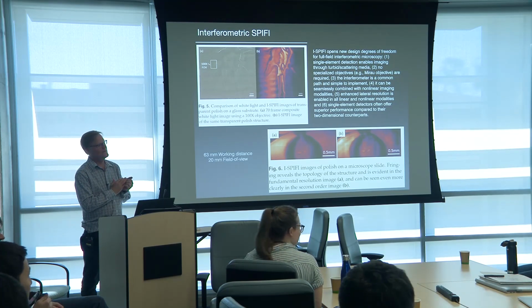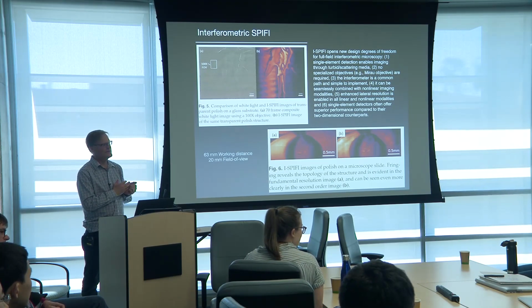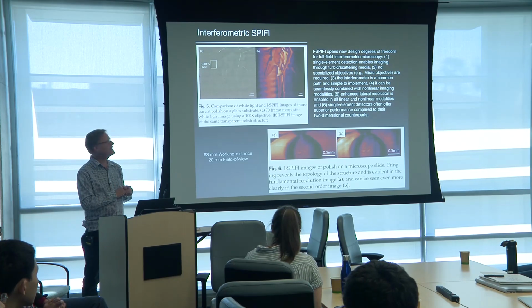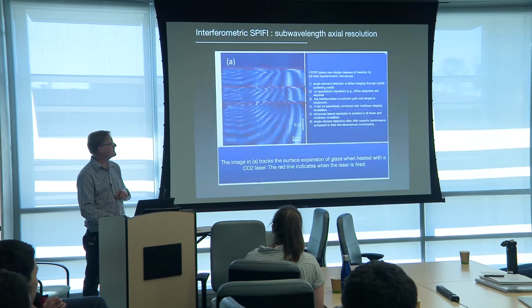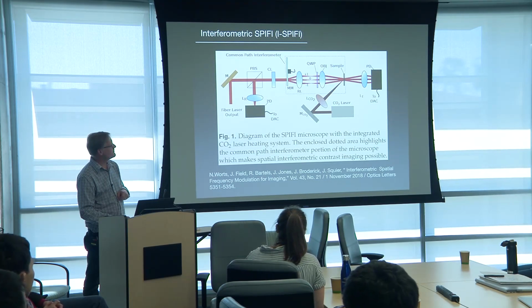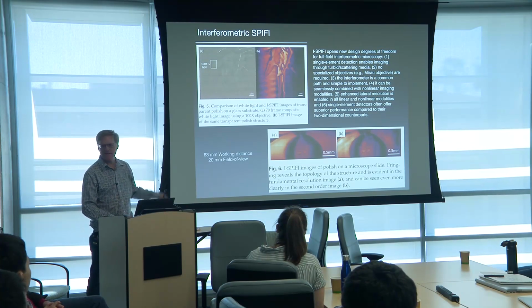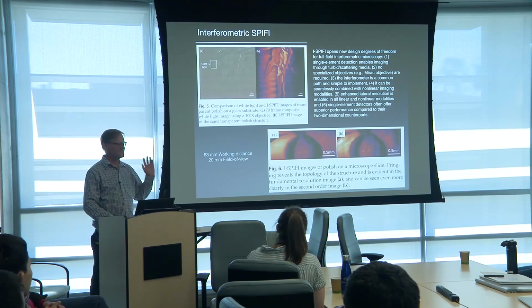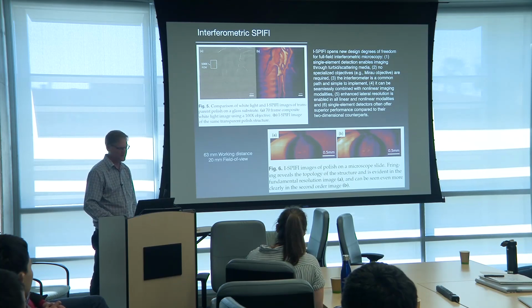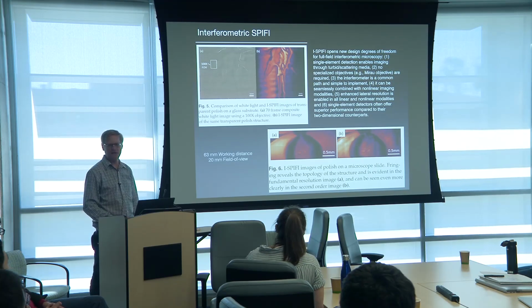It all depends on what the signal amplitude you get out of this was. If you could do single trial AP imaging with it, then great. But if not, then it might be different. And also maybe interesting is that I'm using a laser and imaging in the fundamental, at maybe a milliwatt, and you can have a 5-watt laser. So this is in the linear mode, and you've got plenty of room to grow. So all great questions, and we're kind of mapping out all this space.